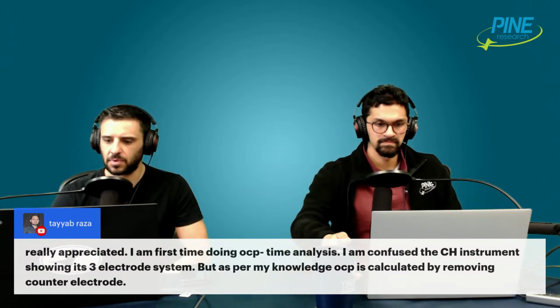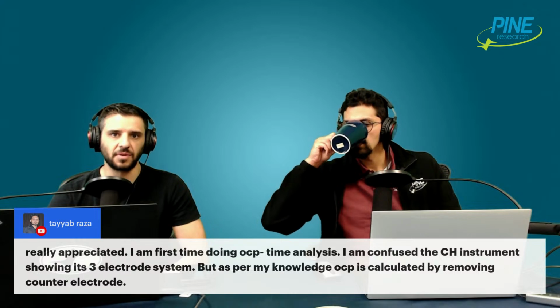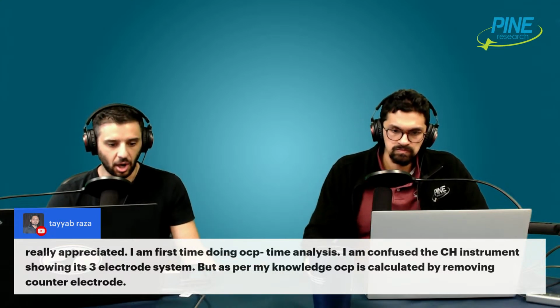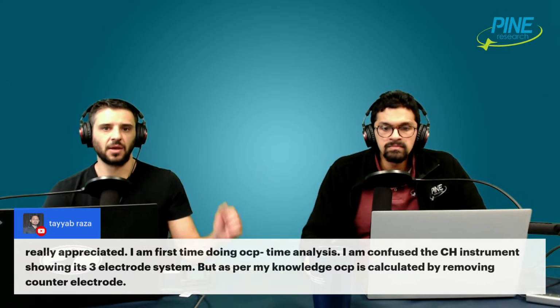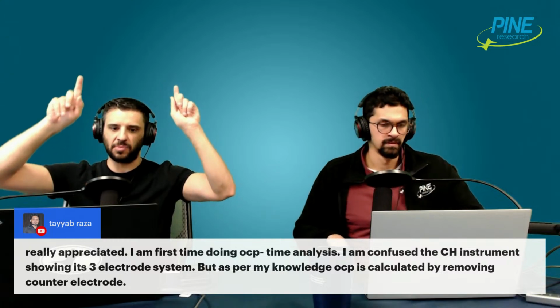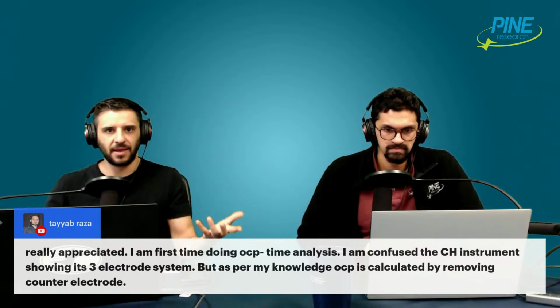The key here is that the potentiostat is removing the counter electrode in its circuitry. You don't have to remove it yourself. I don't know if that's physically what's happening in a CH instrument, for example. That's not our company. I don't exactly know what they are doing physically, but you can imagine the counter electrode, working electrode, and reference electrode are connected into the instrument. As part of the OCP measurement, the potentiostat just cuts off the counter electrode connection. Like there's a switch and it opens the switch. That's probably not exactly what's happening, but you can imagine that's effectively what's happening.